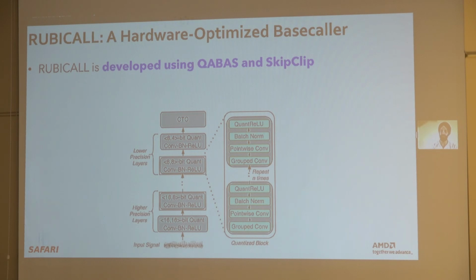So it really performs hardware aware and also algorithmic aware search. And in the end, we have a CTC block which decodes the nucleotides to map them to ACGT base pairs. So in the end, we have a really mixed precision architecture.